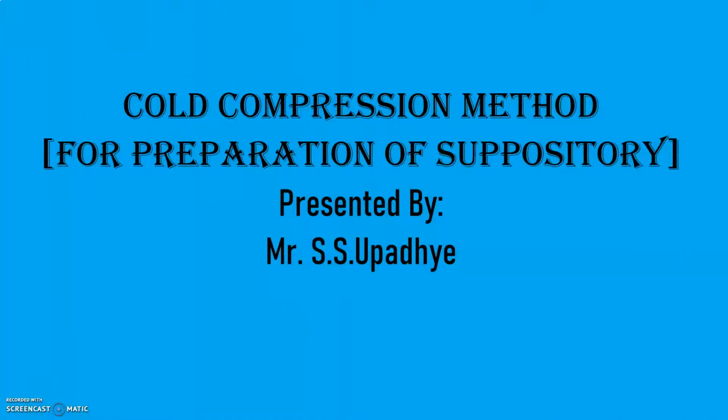Dear learners, welcome to this presentation on cold compression method. This method is used for the preparation of suppository.